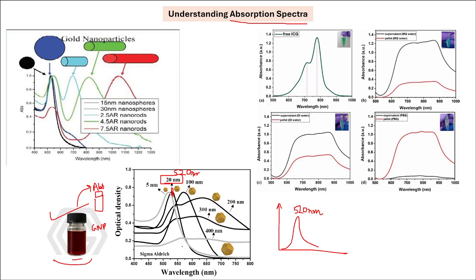Now we'll also see, because whenever we are talking about nanoparticle characterization, it's not like you have synthesized this, did the absorption spectroscopy, got an absorption peak at 520 nanometer, and then the work is completed.